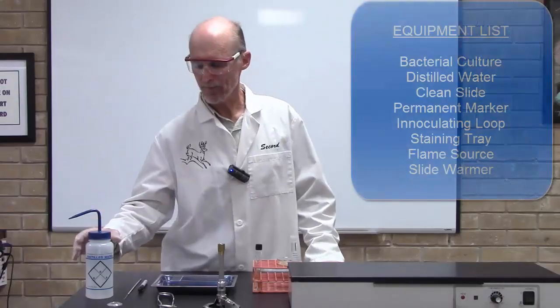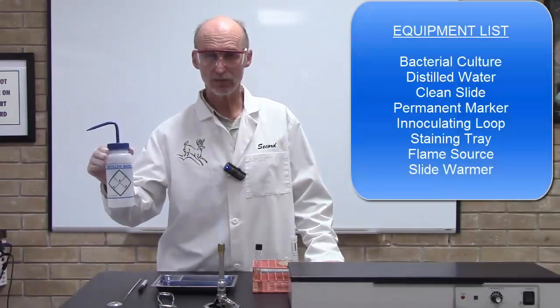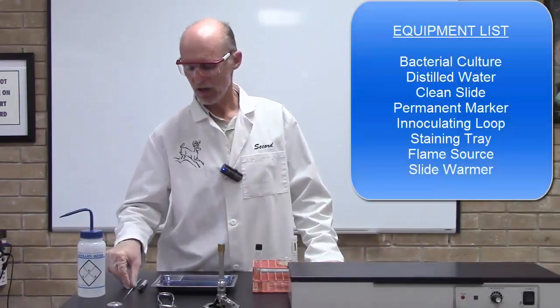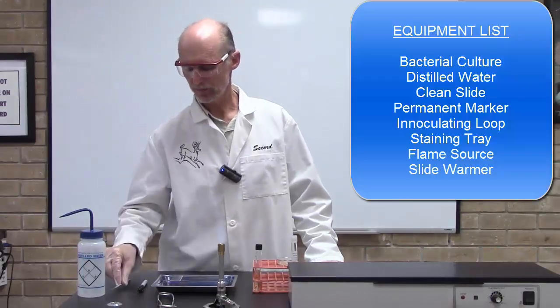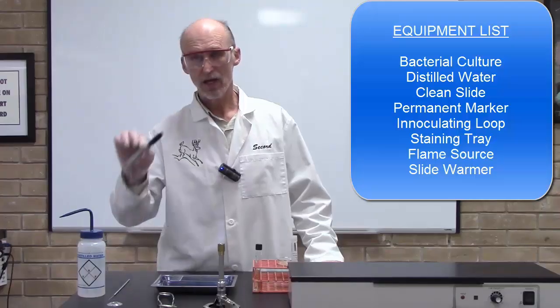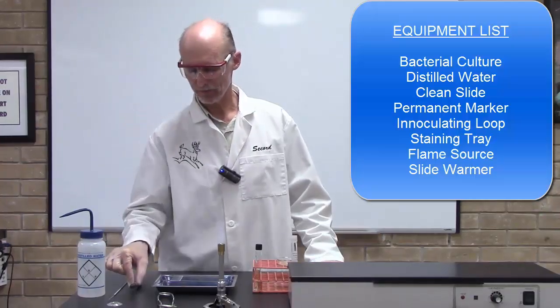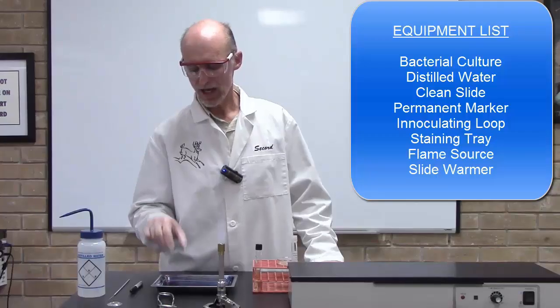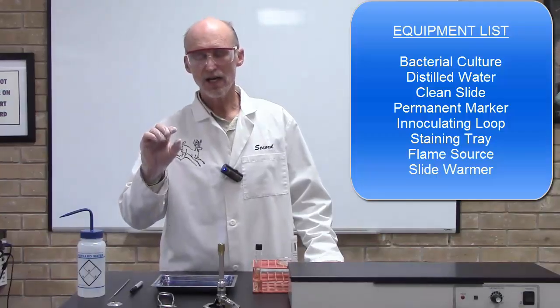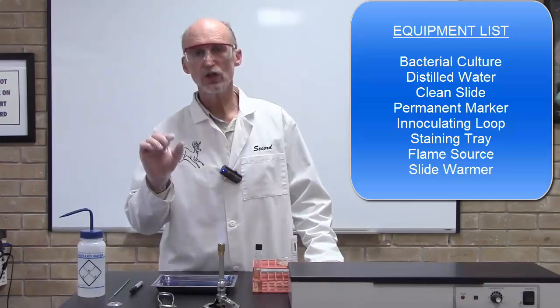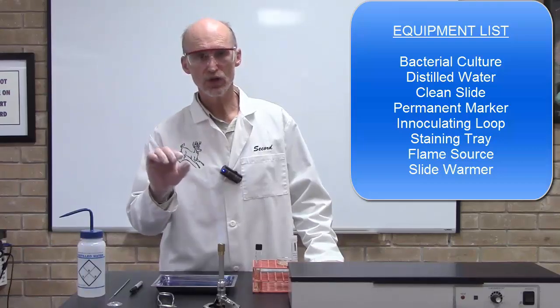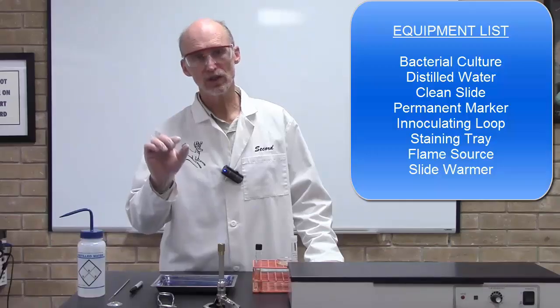First of all, you'll need some distilled water, a microscope slide. Now if your microscope slide is dirty and you need to clean it, use alcohol. Don't use soap. Use alcohol because it won't leave a residue.